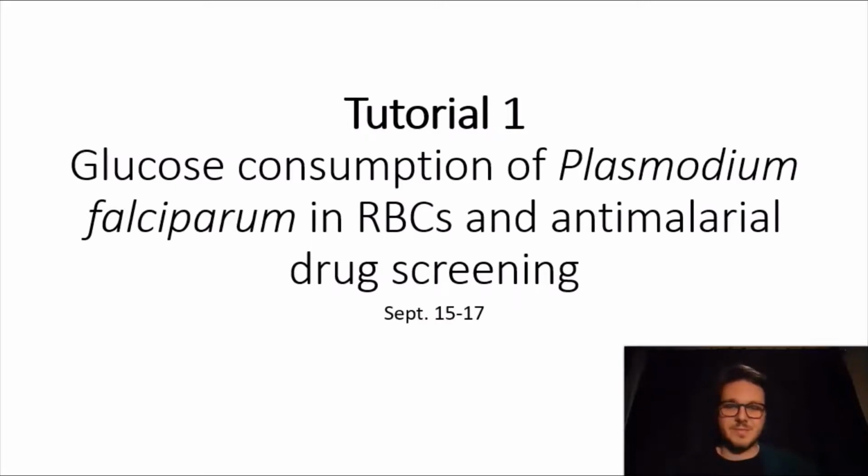Hello everyone and welcome to tutorial 1 of BChem 443. I'm Colin and today I'll be taking you through a virtual experiment for detecting glucose consumption in red blood cells when infected with the malaria parasite.